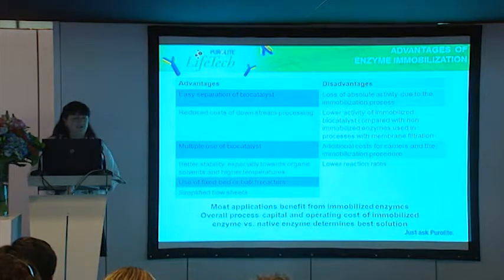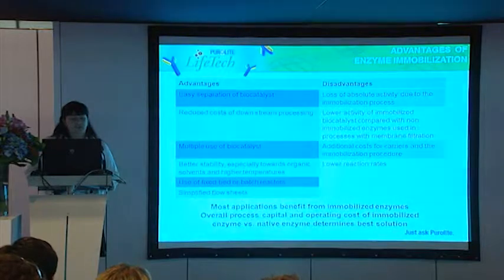Of course, there is an easy separation. The enzyme is immobilized on a carrier in a physical bead, so it can be easily separated, and you reduce the cost of downstream processing.